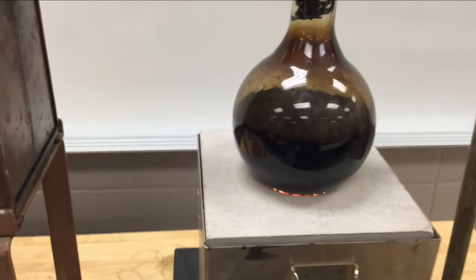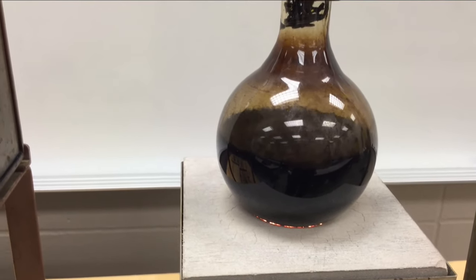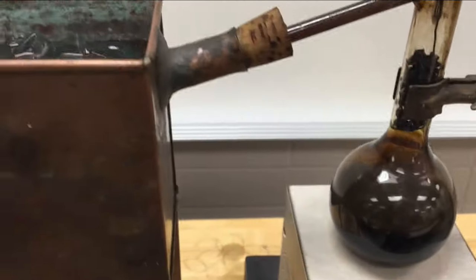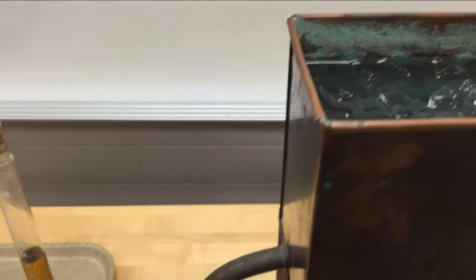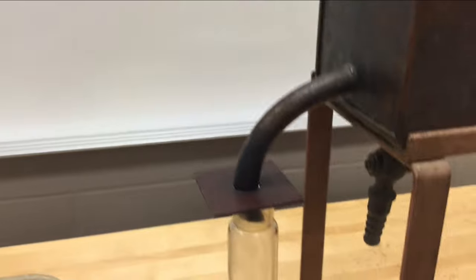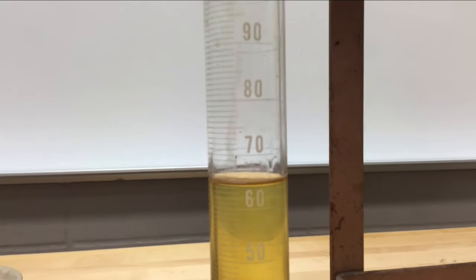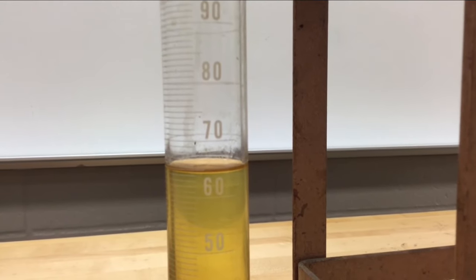You can see it boiling really good there now. I cranked up the heat at the very end here, so it's boiling really, really good right now. If I come over and follow the tube down through the ice bath, gotta go slow so you guys don't get dizzy, then it's coming down out of my condenser into my container. I can see that I have still some dripping going on, and it'll probably be 65 milliliters before I'm all said and done.